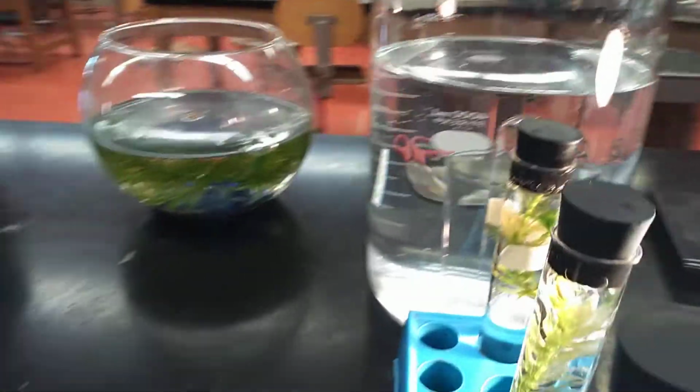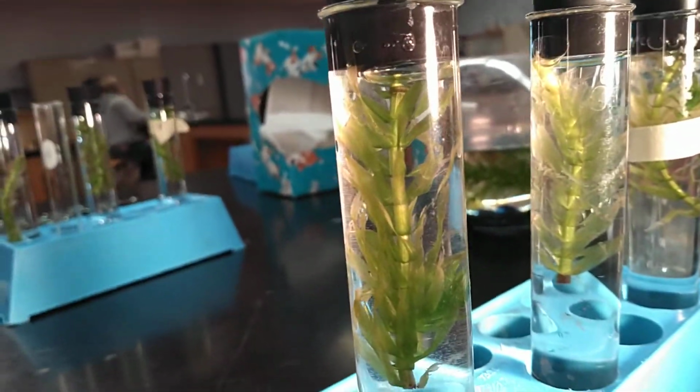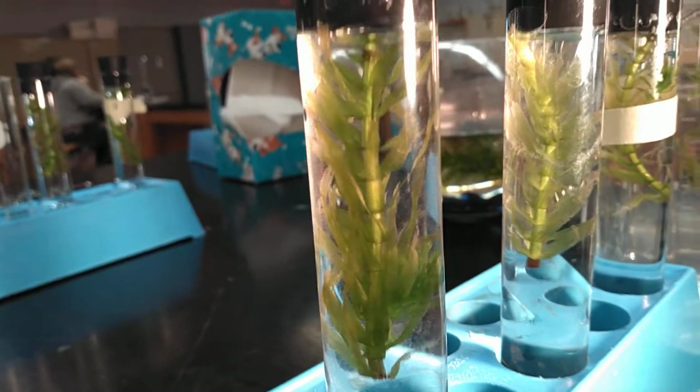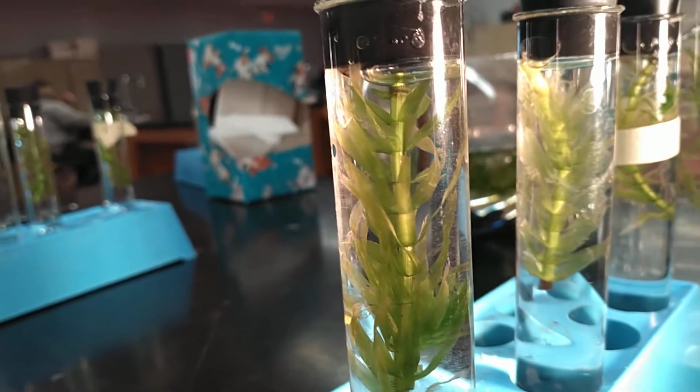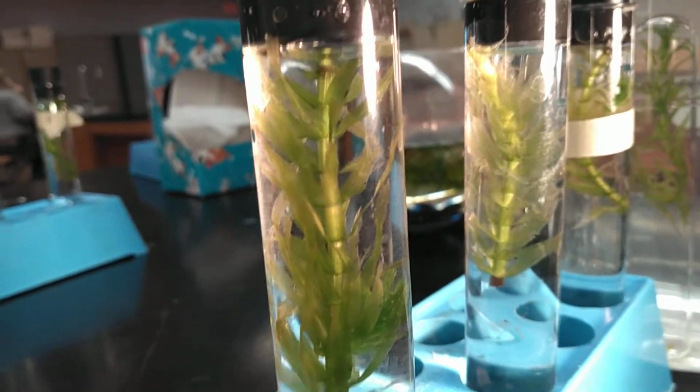So what am I hoping for students to see? If you look really closely at these, you can see little bubbles. Where are these bubbles coming from? These bubbles are produced from photosynthesis. They're going to be oxygen.